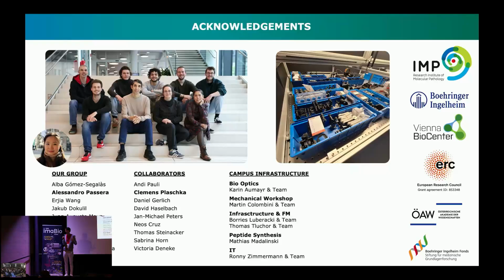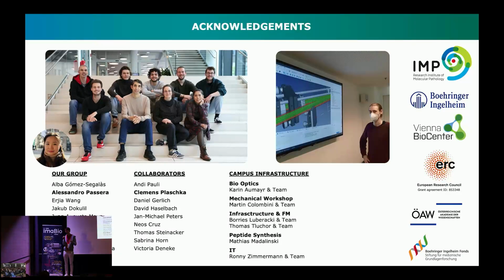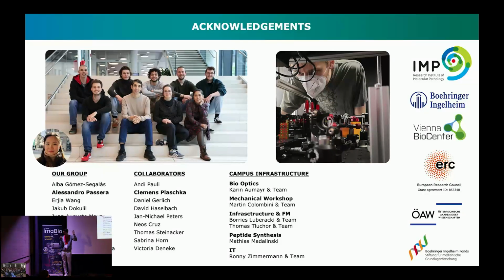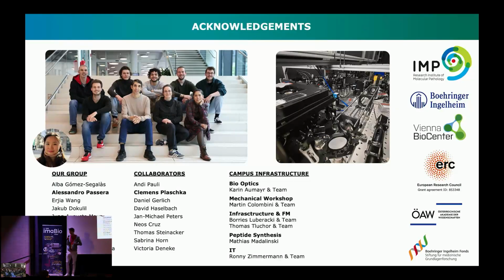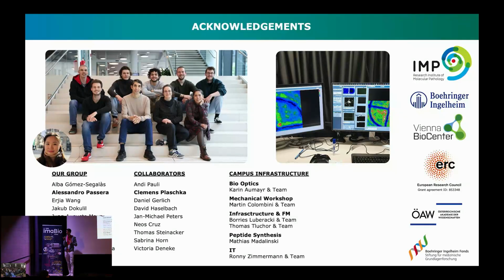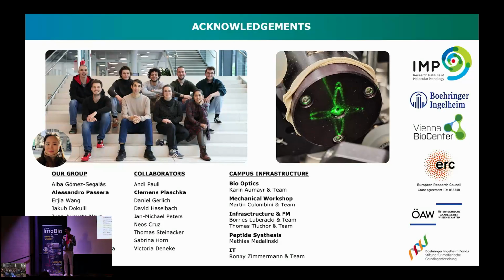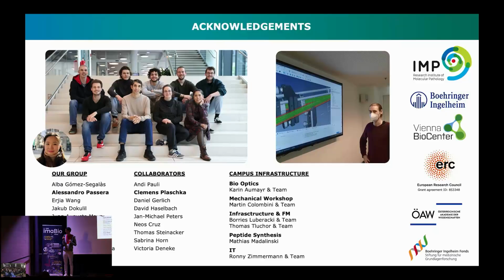So I think what will happen here, of course, there is a need, not for this, but for other reasons as well, to have these high-end structured illumination-based techniques boosted in throughput. Several groups are attacking that, of course, me too. And it will be important to do relevant things with them.